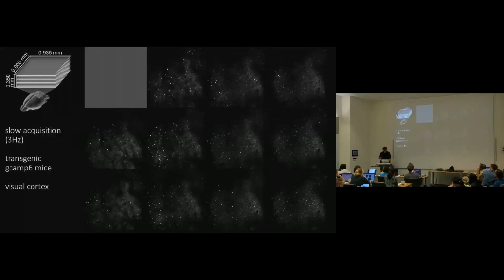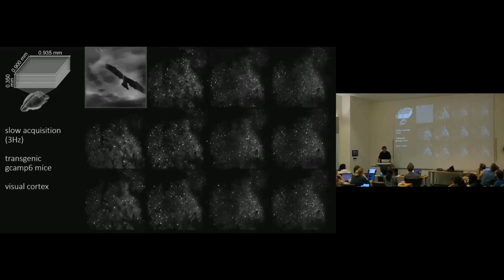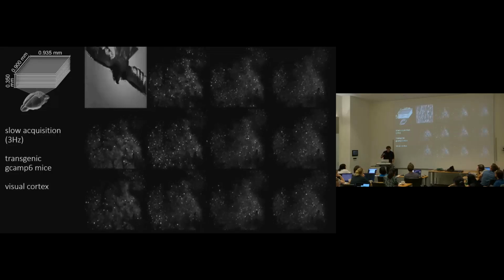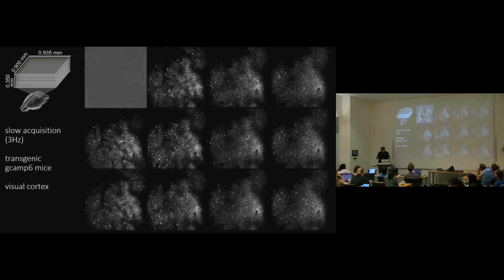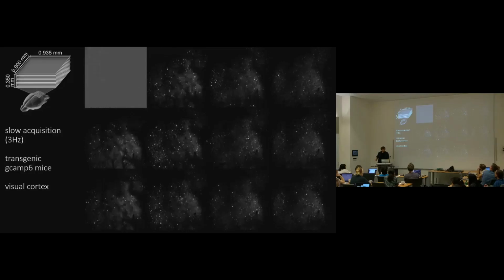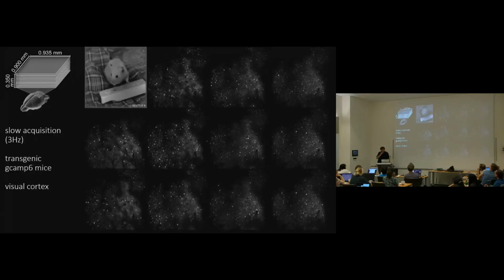Okay, again, just another way to get a lot of cells. I should also say this is the reason we kind of started with this in the first place with suite2p, is that we were trying to do these very large-scale recordings, and so we wanted to minimize as much as possible the amount of manual curation we'd have to do on these data sets. So the algorithms had to be fairly good, but also fairly fast, because we didn't want to wait forever or have to use big computing resources to run them.